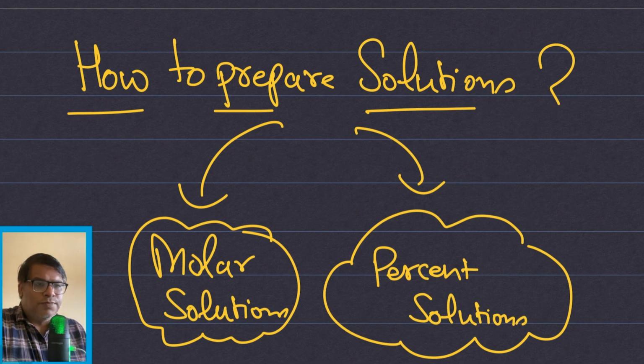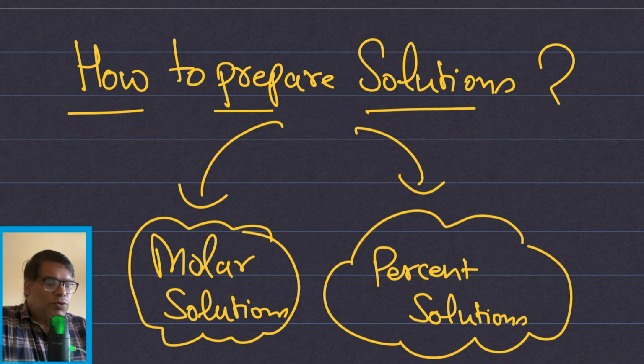So through this video, you will learn how to accurately prepare percent solutions.